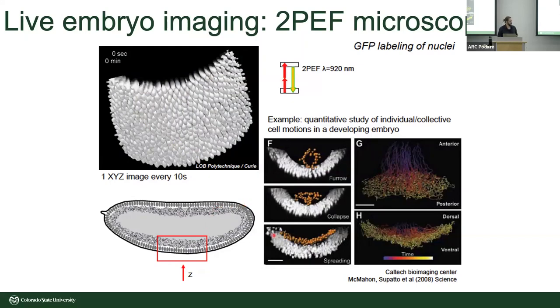And I bring it up as a way to mention that we do have an incubation chamber on our microscope as well. So long-term imaging with an incubation chamber, time-lapse imaging, and keeping your cells alive over a long time to watch development is something we can do on our system.